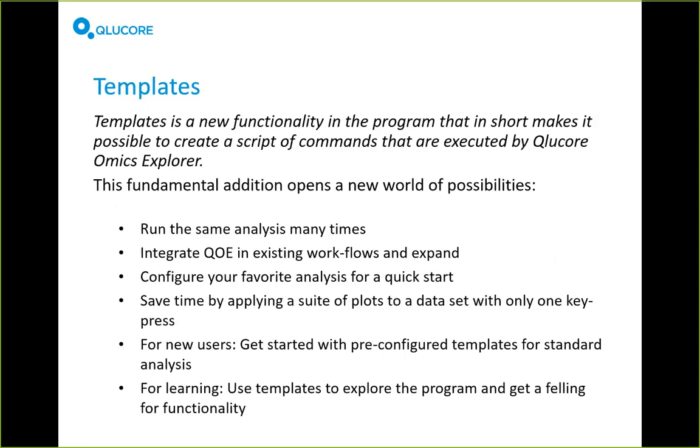So all the steps needed to do the analysis, to set up the statistics correctly, bring up the right plots, configure those plots, and generate reports or exports. You could set that up as a script, and then you could run that same script for many different data sets, for example, instead of having to do that manually. It will save you time. It will also make your analysis better, because this removes parts of the human factor from the loop, as the steps will be perfectly repeatable.